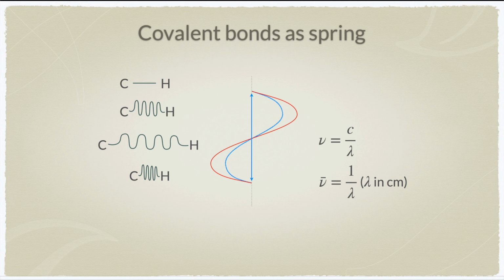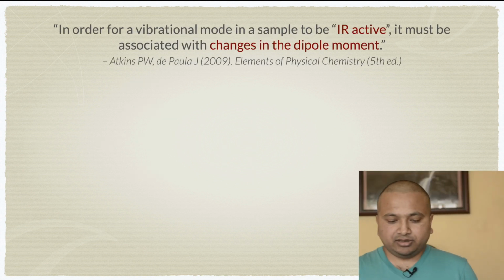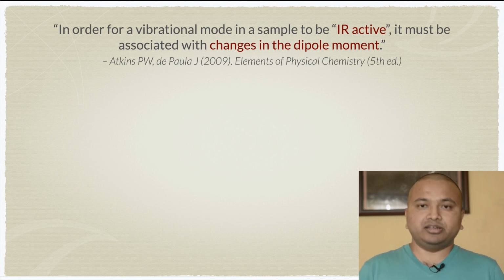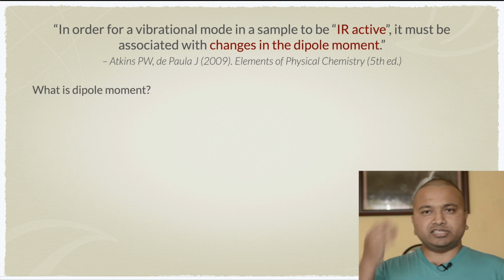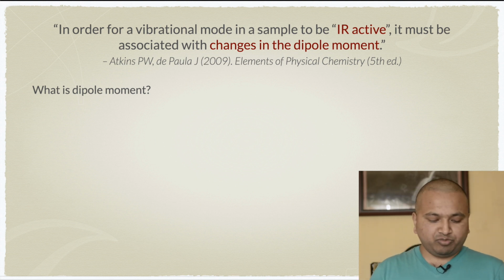It is because covalent bonds can either stretch or contract and vibrate between two atoms. So, we will come back to that statement earlier. In order for a vibration mode in a sample to be IR active, it must be associated with a change in the dipole moment. So, we need to understand first what a dipole moment is. I think you can still remember the meaning of a dipole moment.